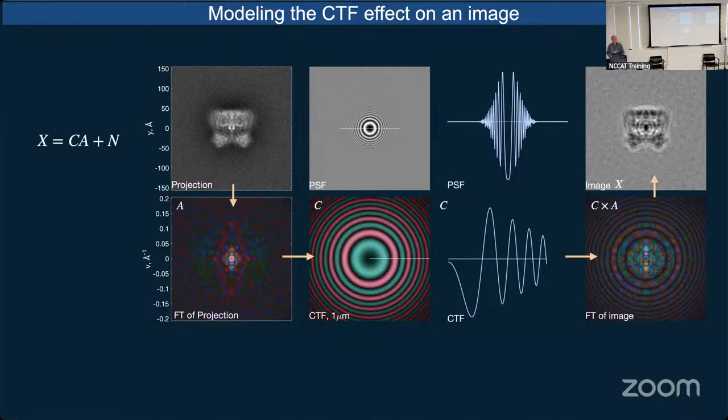People who work at very high resolution actually do a defocus estimation per particle in case the specimen is not completely flat. But that's something you do when you want high resolution. Let's say, you're going to 2, 1.5, 1 angstrom. So per box, you have a different CTF per box. Yeah. It gets more and more complicated the higher resolution you want.